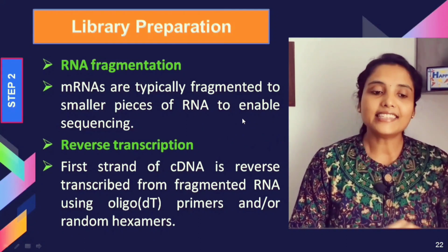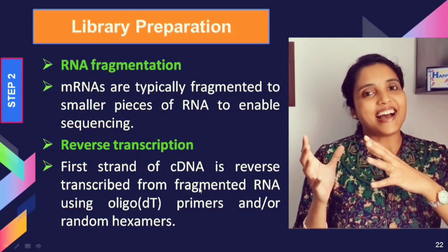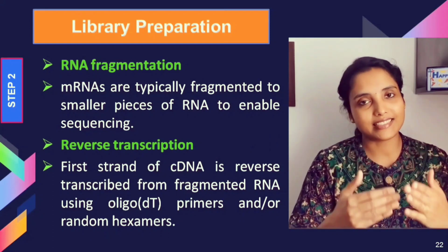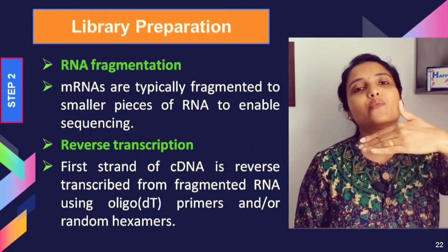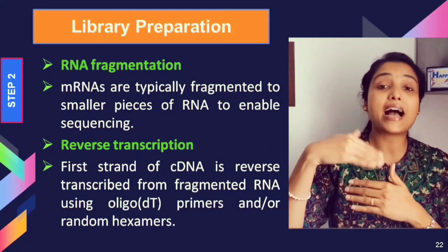Okay. The next step is reverse transcription. I hope by now you know the concept of reverse transcription, right? Transcription is DNA to RNA. So reverse transcription is when you go the reverse way, RNA back to DNA.